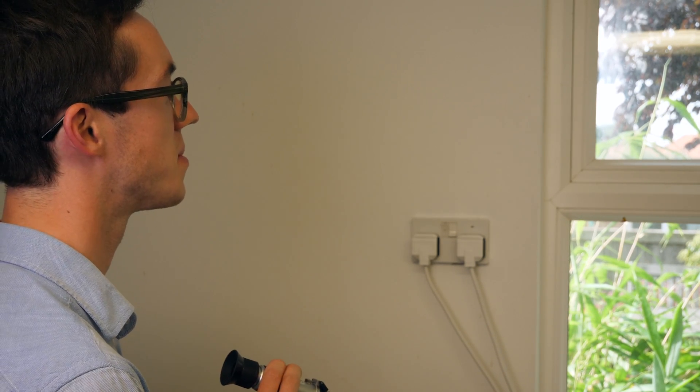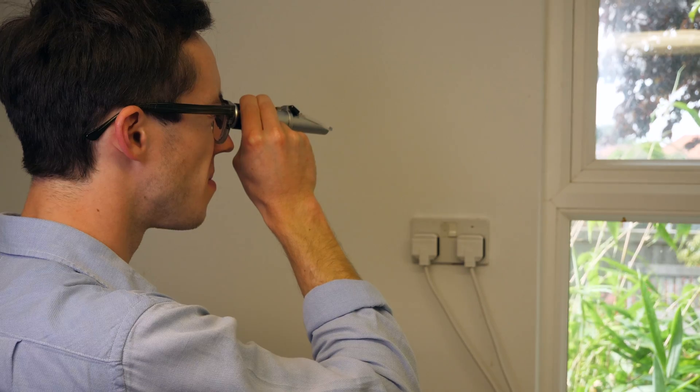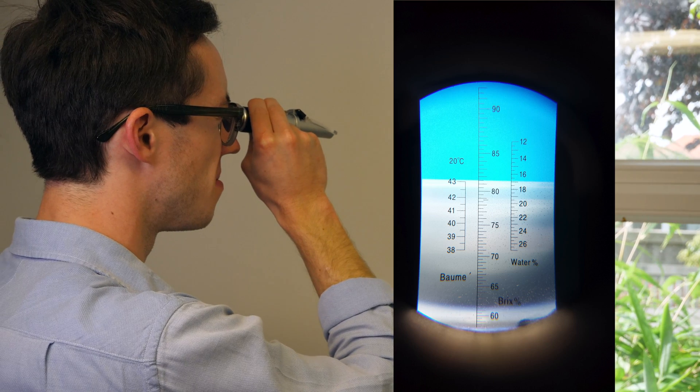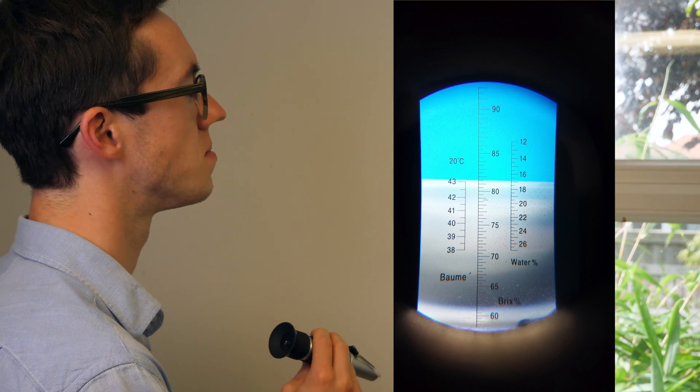I'm fortunate to have an able assistant with me today — this is Adam — who is going to take the reading from the refractometer. Adam looks through the eyepiece and reports we have just over 17%. That's fantastic — 17% means we've got a really good honey and there's no chance it's going to cause any fermentation in the jar. As you can see, it's a really simple process using a refractometer to test for the water content of your honey, and it's something that's really important after all the work this season.